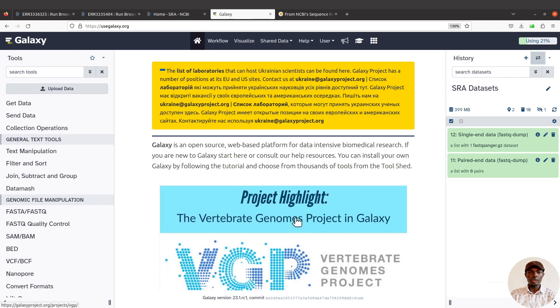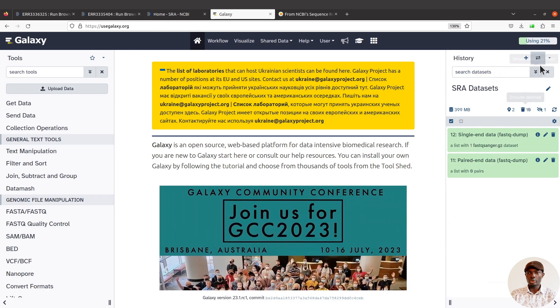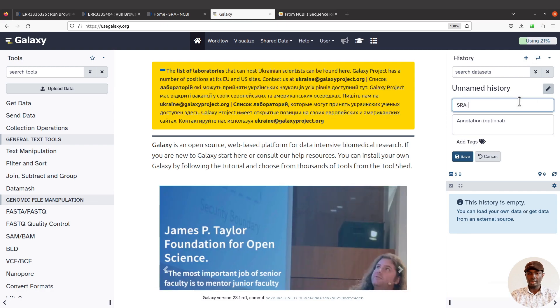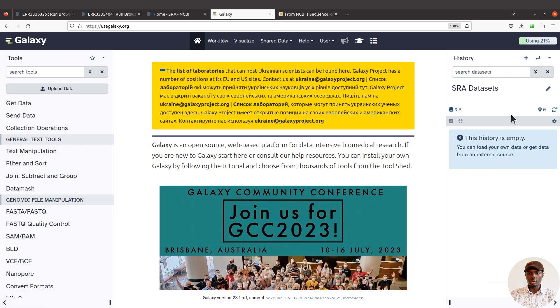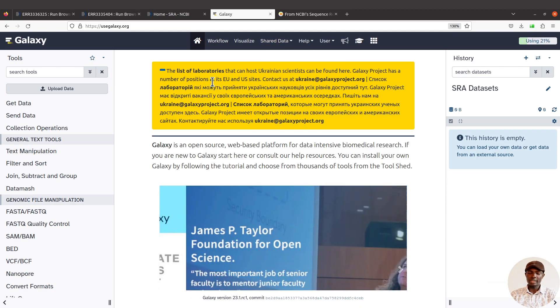First of all, make sure to create an account on the Galaxy platform and then log in. Then you can proceed. Let's start by creating a new history — that will help us to track our data. I'll come to the side, click on 'Create a new history', and name it. Perfect, so I now have a new history. I'm going to import the data into this history.